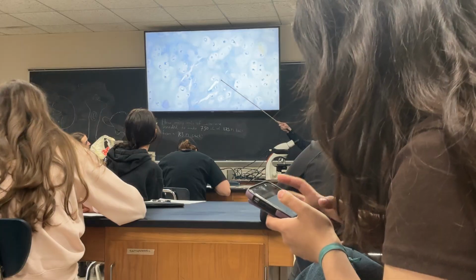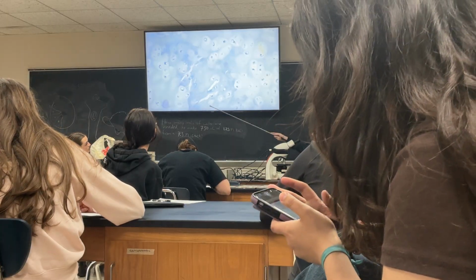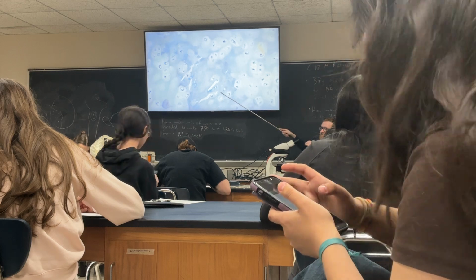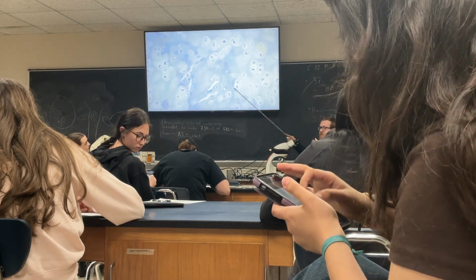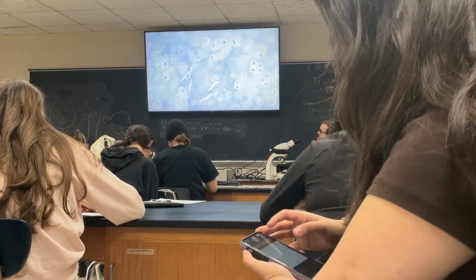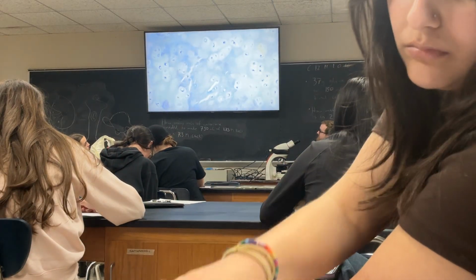That's because of staining. That's because the way the histo ended up for this slide wasn't great. But within that, it's smooth. I can't see individual protein fibers. So this is hyaline, this is glassy cartilage. This is one that I think looks like grains of sand embedded in smooth glass.